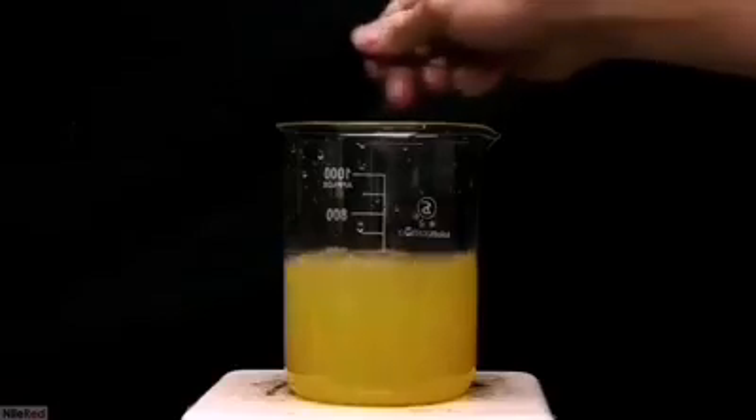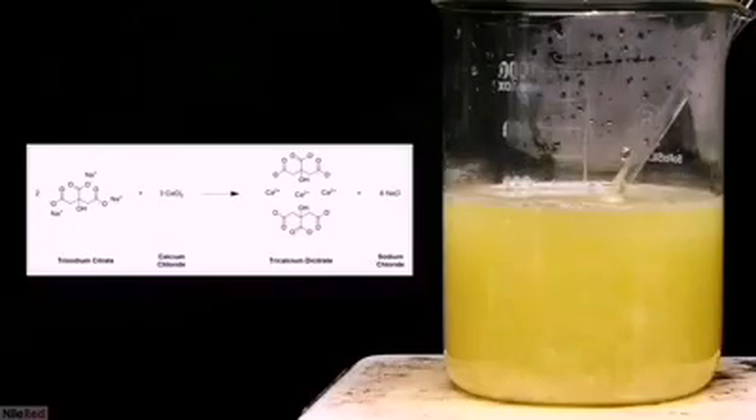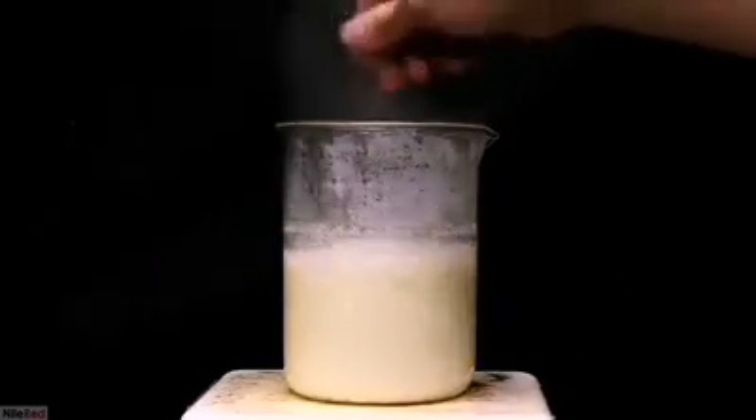Not much is going to happen at room temperature, and to get the reaction going we have to heat it up to boiling. As the solution gets hotter, we start to see calcium citrate forming. The reaction here is a double displacement, where calcium chloride reacts with trisodium citrate to form tricalcium dicitrate and sodium chloride. We have a dicitrate because we need to balance the 2+ charge of calcium. Sodium chloride is very soluble in water, but the tricalcium dicitrate isn't, so it precipitates out. As it got closer to the boiling point, a lot of precipitate appeared quite quickly, and I stirred it for a few minutes.